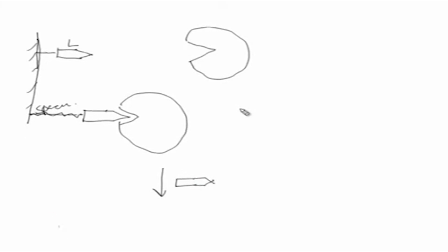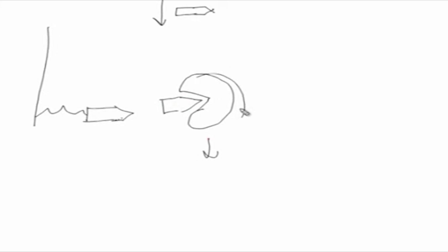Now, when you have a free ligand in higher concentration, what will happen? This free ligand in higher concentration will replace the bound ligand on the column. So, you will get an elution pattern where the free ligand has replaced the bound ligand, and this whole thing could then be passed as an eluate from the column.